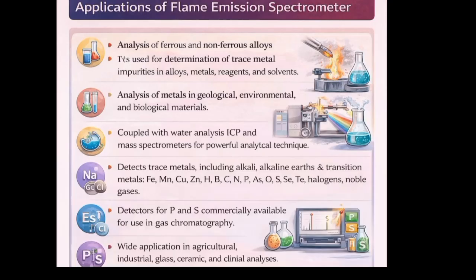Applications. It is used for the analysis of ferrous and non-ferrous alloys. It is used for the determination of trace metal impurities in alloys, metals, reagents, and solvents. It is used for the analysis of metals in geological, environmental, and biological materials.